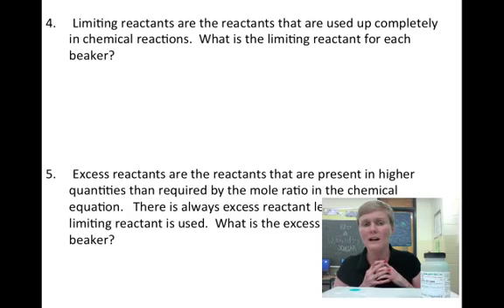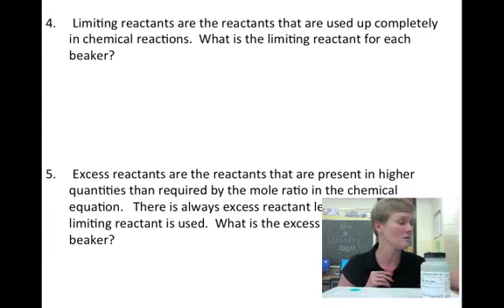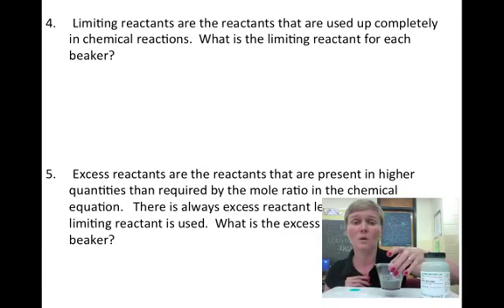Okay, so limiting reactants are the reactants that are used up completely. What's the limiting reactant for each beaker? So we go back to beaker 1. The aluminum was completely used up. So limiting reactant is aluminum for number 1. Double check your answers.